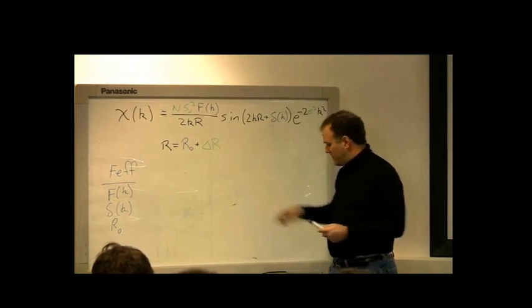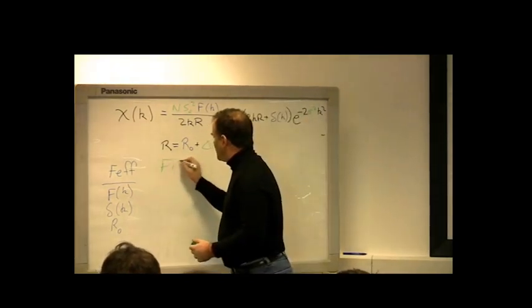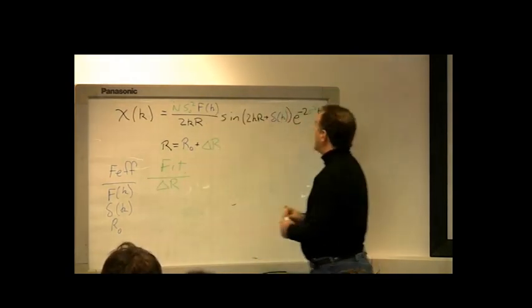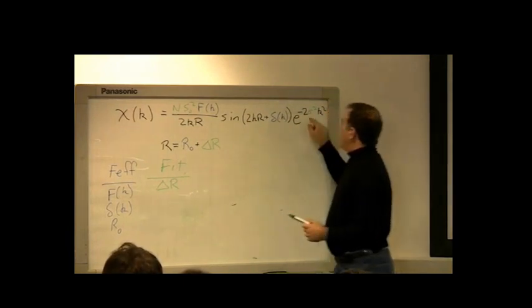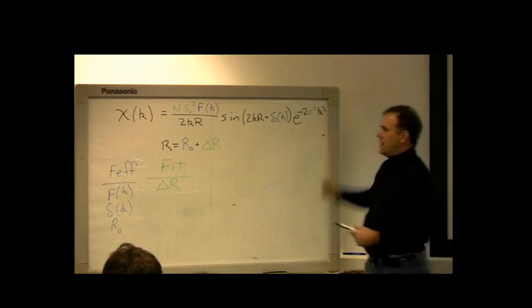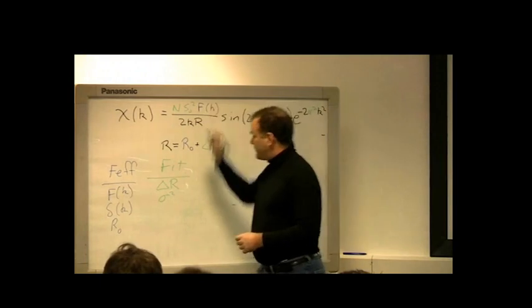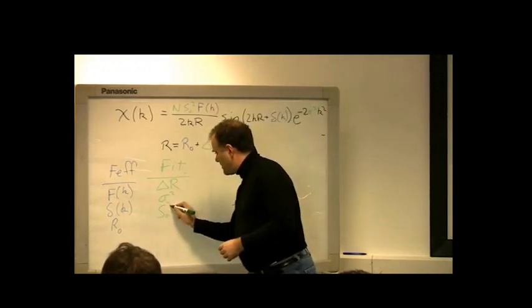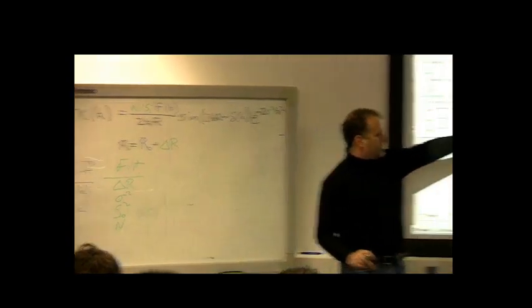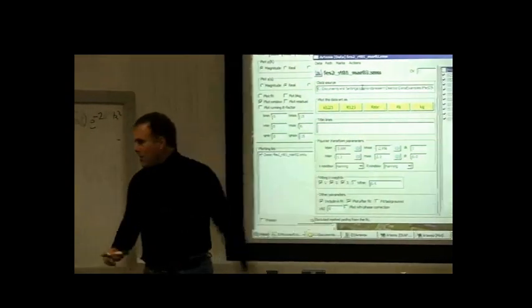So, in the fit, we measure delta R, and we need to somehow determine sigma squared also. That's something that will come out of the fit. S0 squared, possibly n, although as we'll talk about in a second, n is not an unknown in this fit. N is 6 in this example. But in general, n is something that has to be evaluated.